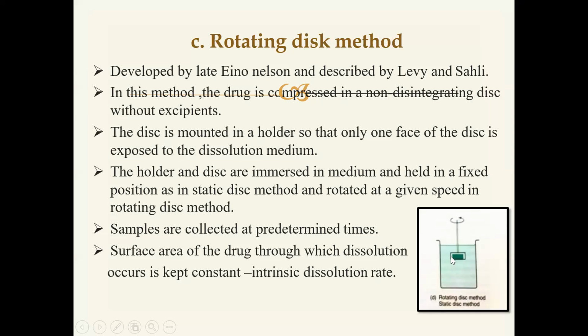Next, this holder is attached to the metal shaft. By using this metal shaft, the stirring speed is precisely controlled.